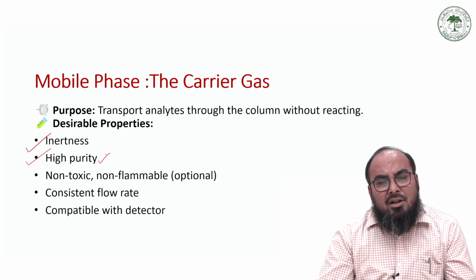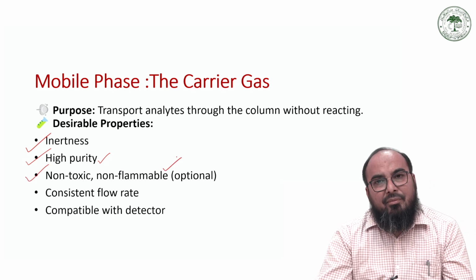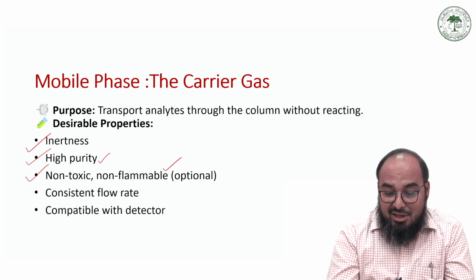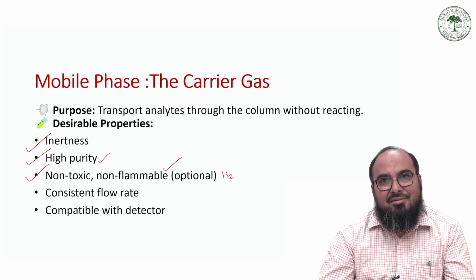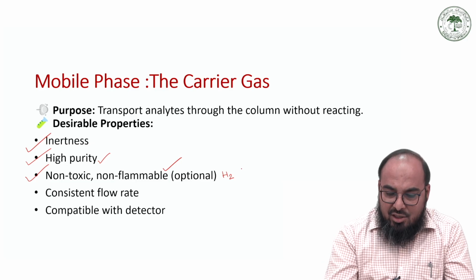Similarly, your carrier gas must be non-toxic. It must be non-flammable. Although in certain cases we use H2 also, again we have to avoid it as much as we can. So it must be avoided.